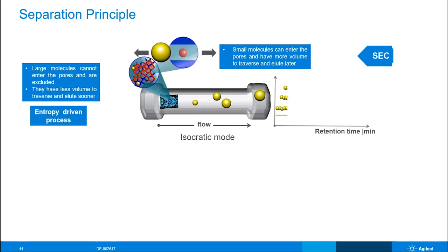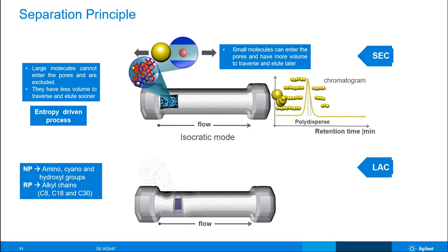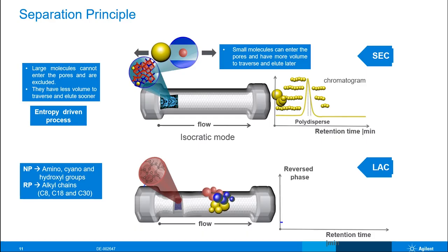Now, we can contrast this against something like an HPLC type separation, where we have chemistry on the stationary phase that we're trying to interact with. That allows us to do something like, in this case, a reverse phase separation, where we'll have polar things come out first and nonpolar things coming out last. But we can also change up our separation by changing column chemistry and column conditions.